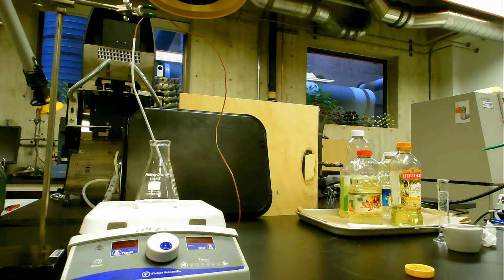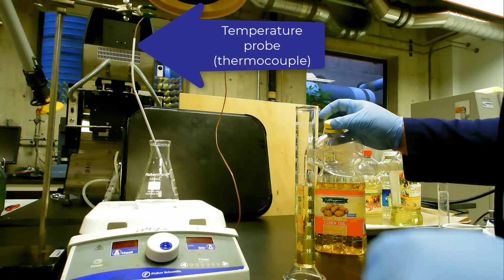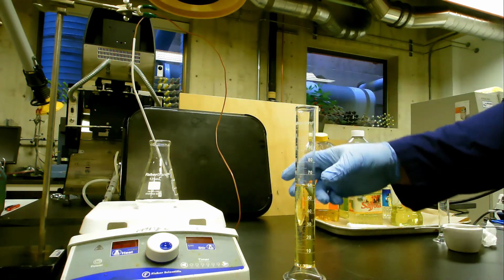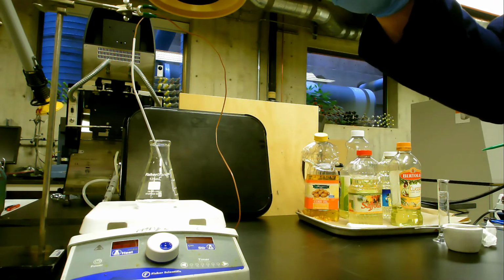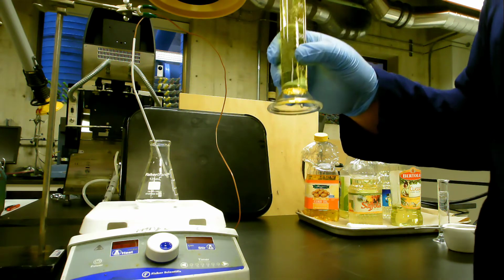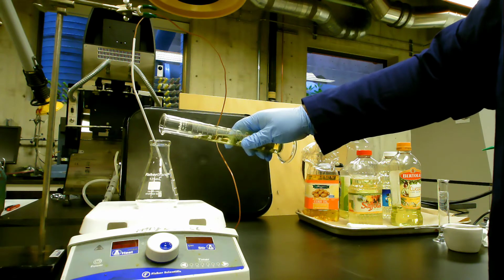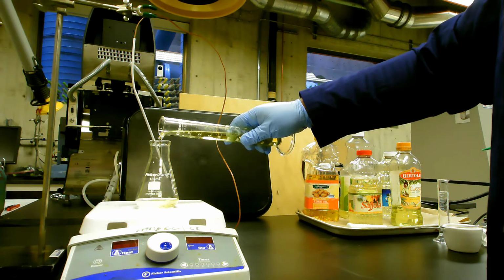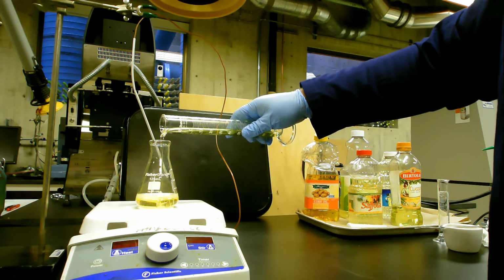In this setup, we've also attached a temperature probe, which is that kind of white stick coming out of the top that goes to the little brown cord. That enables the hot plate to set the temperature of the liquid for us, and it helps us with accuracy of temperature. So once we've added our liquid, all we need to do is set the temperature probe placement in the liquid to make sure that it's not going to hit the stir bar, and then we can start our heating ramp.